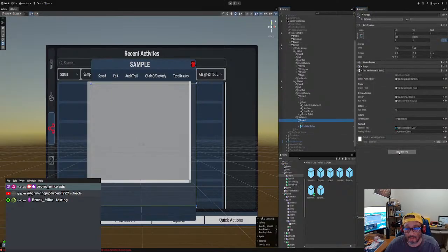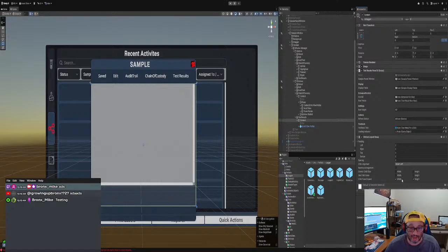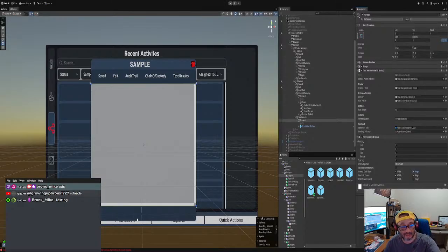Now on here, I like to put a panel layout, a vertical panel, just so it can align everything correctly, the way I like it. You see what I'm saying? They just took over the whole thing. All right. Okay, and then this is a problem down there. I don't know, I've got to figure that out. We're going to fix everything later. We're going to make it all look nice and pretty.